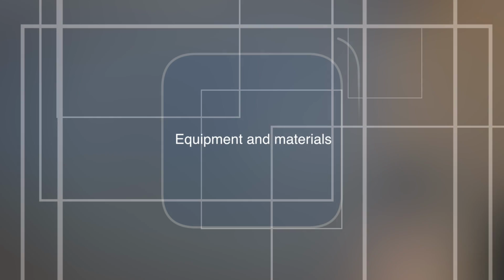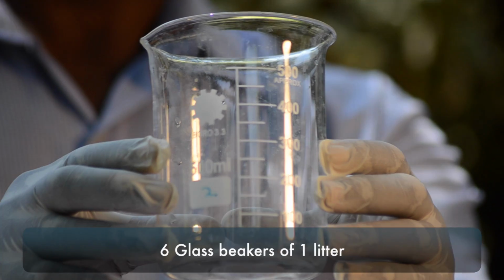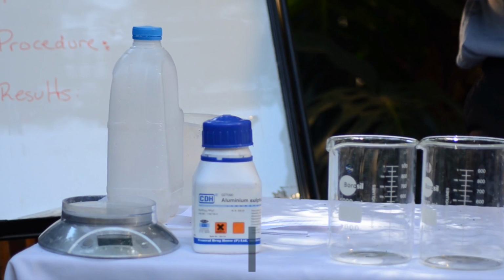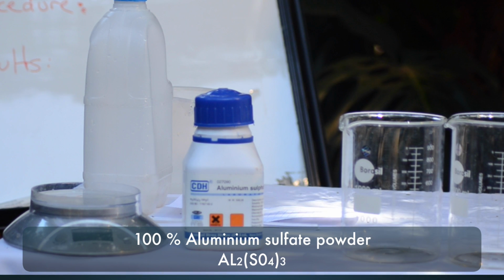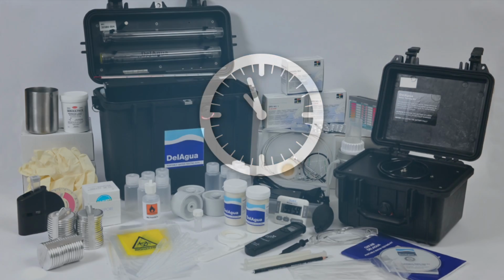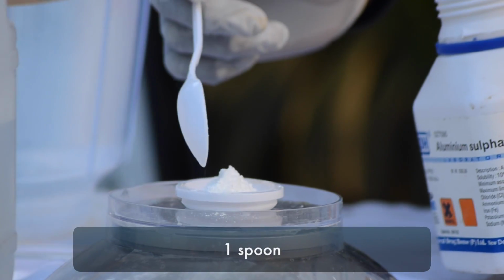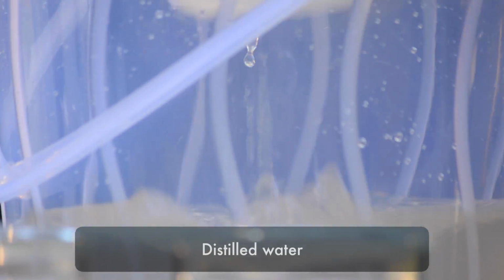To conduct the jar test, the following equipment and materials are necessary. 1. 6 1-litre glass beakers. 2. 1 electronic weight balance. 3. Coagulant products such as aluminium sulfate, Al2(SO4)3, powder at a concentration of 100%. 4. A watch or clock. 5. A turbidity meter. 6. Surgeon's gloves. 7. 1 spoon. 8. A raw sample from the source. 9. Distilled water.